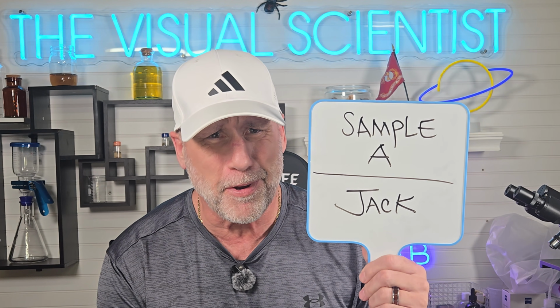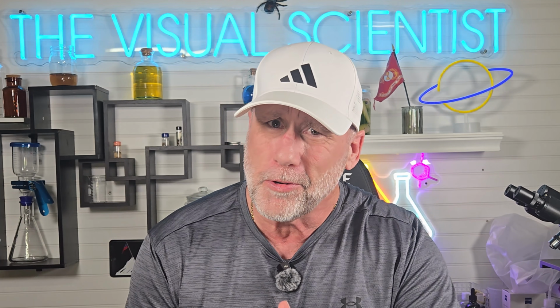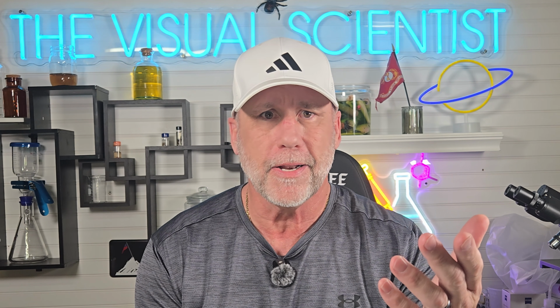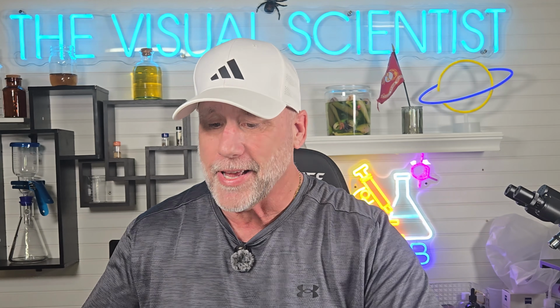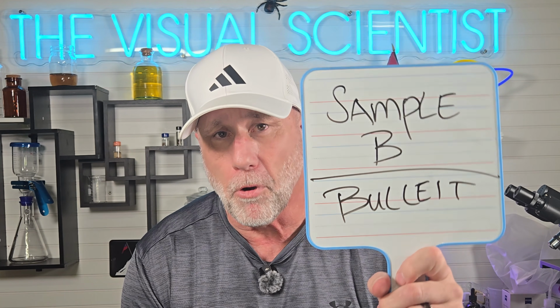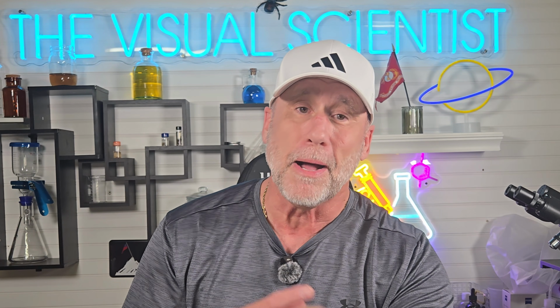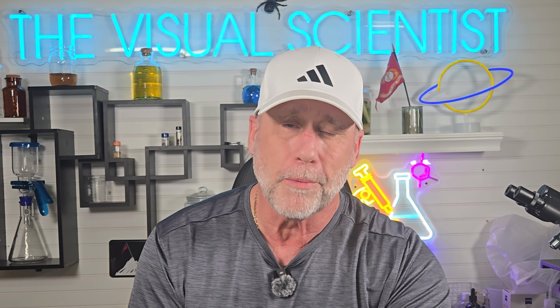Yeah, a lot of bad memories with Jack Daniels. The nematodes slowed down at first, but after a while, they woke up. I couldn't believe it. Never seen that. I wasn't expecting that. All right, guys, sample B was Bulleit. Another bad experience with that. But over time, every nematode stopped moving eventually, and I never saw them recover.